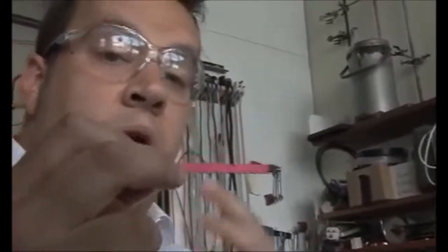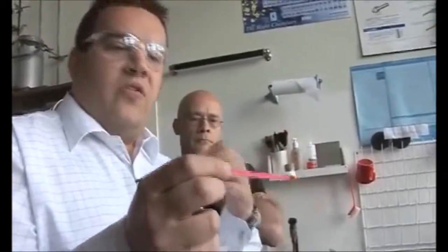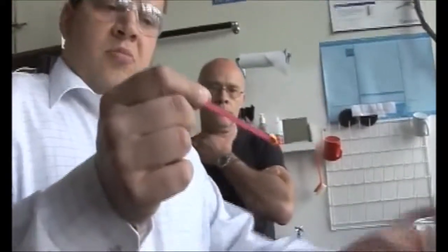Okay, so now what we're going to do is we're going to take the splint out so that it's just glowing. So if I blow on the splint, you can see it gets brighter. Now we're going to try and relight that splint by putting it into a very oxygen rich atmosphere. So we'll move over to the jar and we'll put in our glowing splint, and you can see the flame comes back to life. So that's a test that everyone learns for an oxygen rich environment. What happened? What made that happen? Well, the increased oxygen concentration reignites and reinitiates that oxidation of the wood, or the burning of the wood. So we'll do that again. So there we go. Flame again.